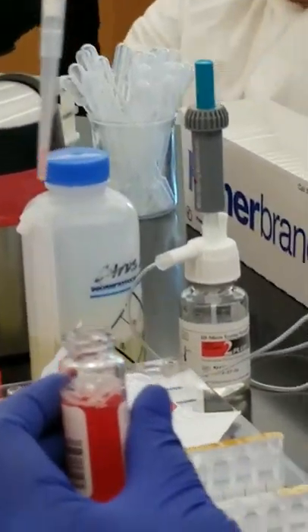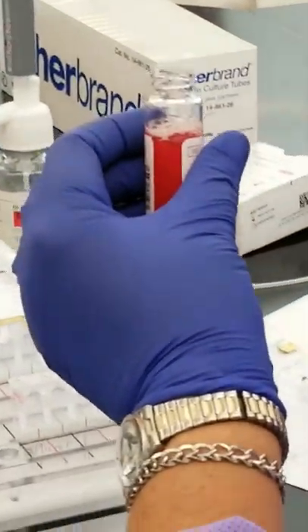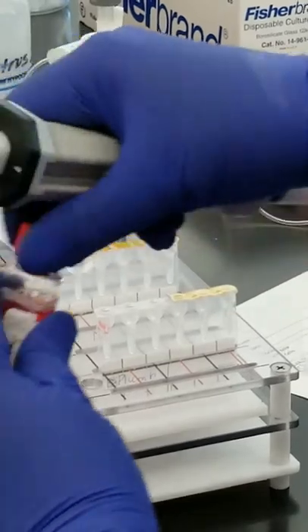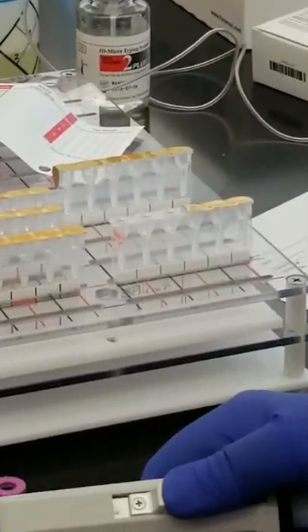If you get too close to that, you're going to be dispensing nothing near 50 microliters. So the silver thing, you run it back in, close it off. If you push the silver button all the way, then the tip pops out.